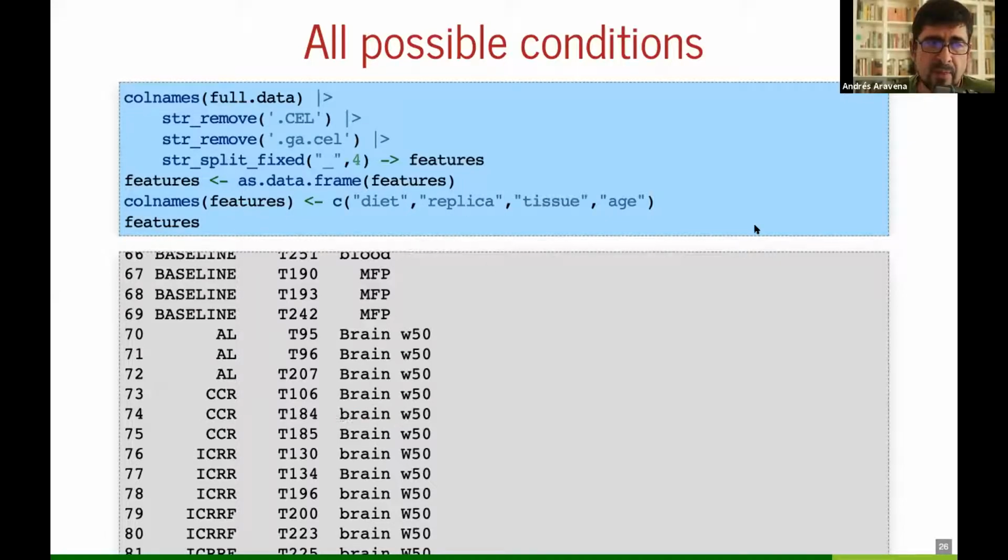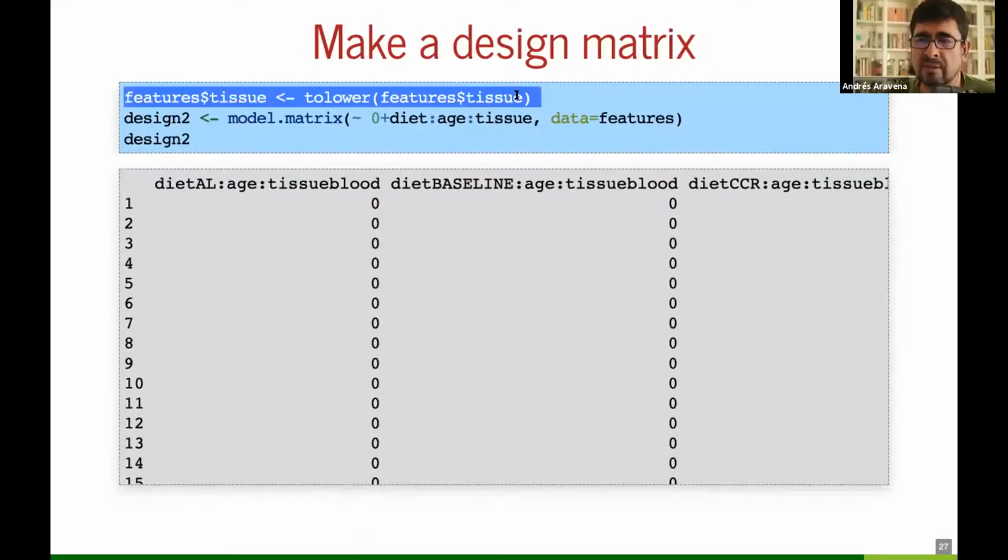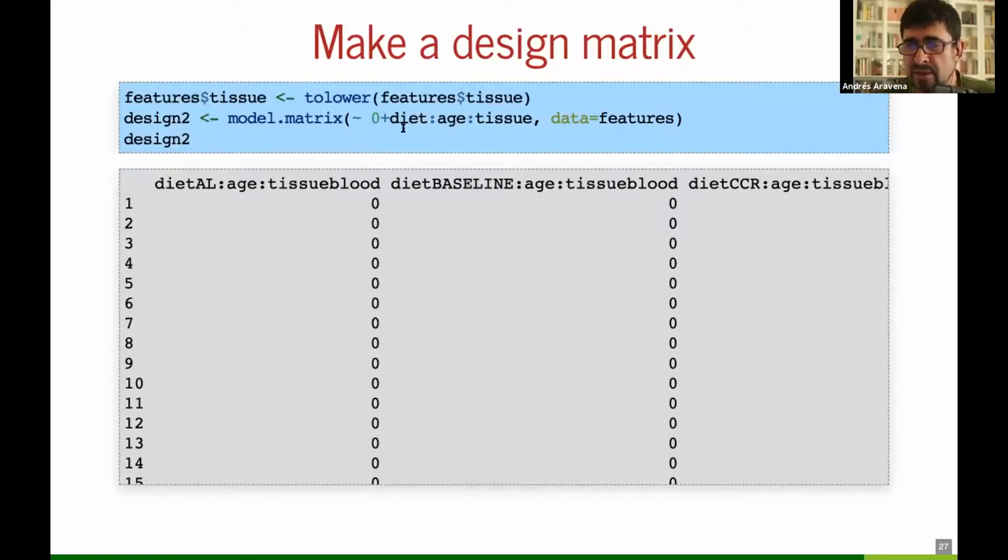I went to first I put everything in lowercase to solve that problem, and I make a design matrix with this formula: 0, because I don't want an intercept. There is no base condition that is common to all one.